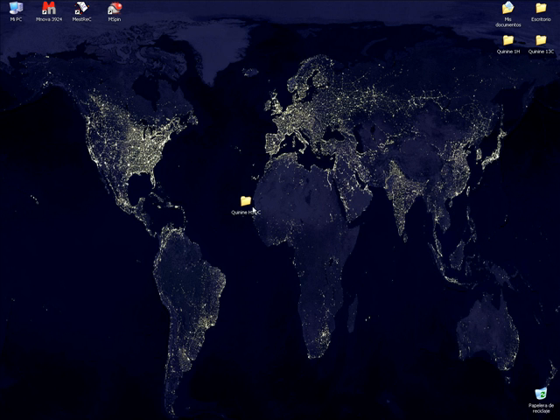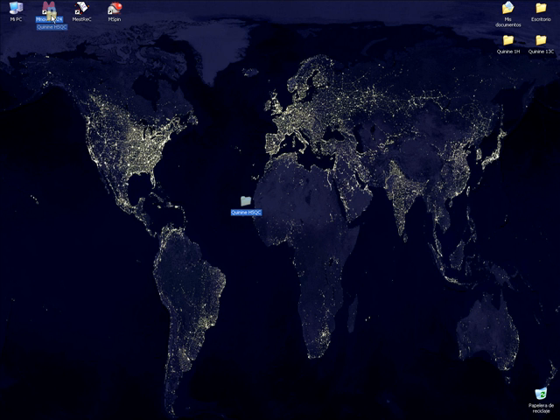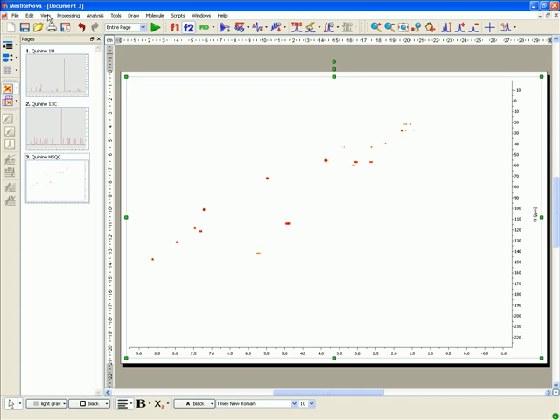The processing of a 2D NMR spectrum is very easy and intuitive. Drag and drop the NMR folder to MNOVA to obtain the processed 2D NMR spectrum.